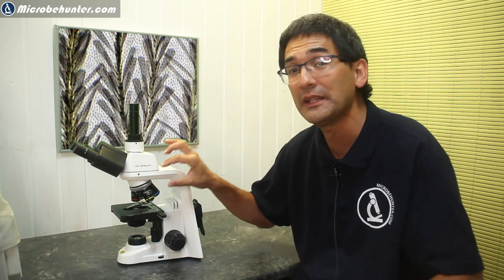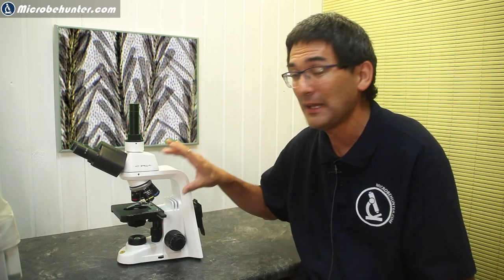Now, this is a microscope that comes in two different versions in two flavors, depending on the size of your wallet and also on the intention that you have with your observation interests. One version, and this is the version that I have over here, comes with so-called infinity optics. That's the more expensive version. And the cheaper version comes with standard achromatic objectives. And this is the one that you can use, for example, for routine microscopy use and also for educational use with students. The plan objectives that this infinity version has gives you a sharp image all the way to the edge of the field of view. And this means that it's very suitable for photography work because the picture is going to be clear and in focus all the way to the edges. Now, if you just do visual work and if you're not so much interested in taking pictures, then the standard objectives of the cheaper version are also going to work just fine.